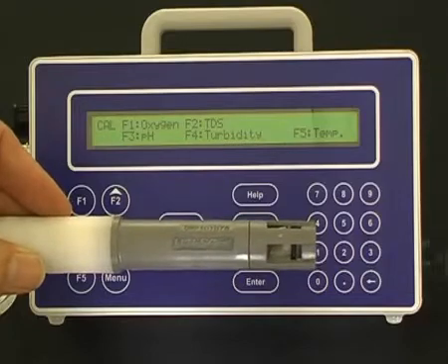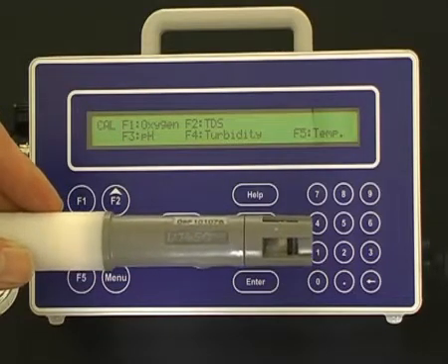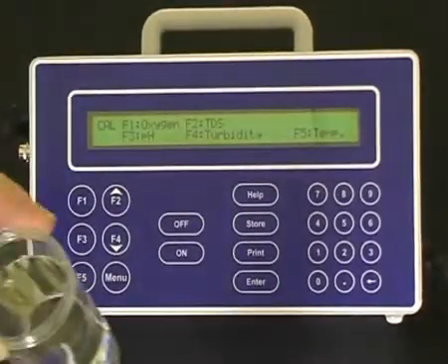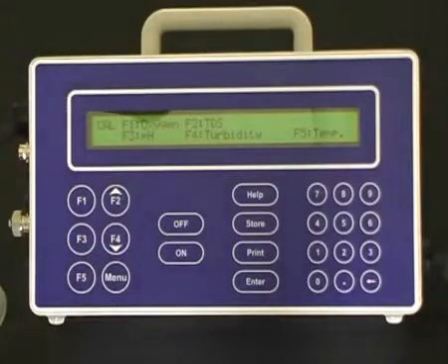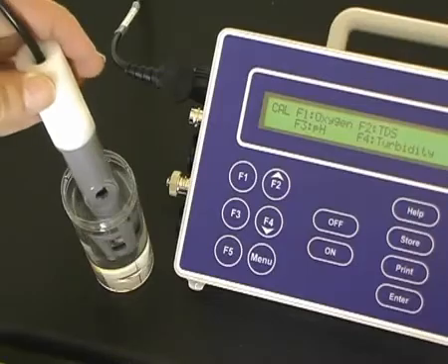The first point for the dissolved oxygen calibration is a zero calibration using the sodium sulfite solution we just prepared. Place the dissolved oxygen sensor in the sodium sulfite solution.